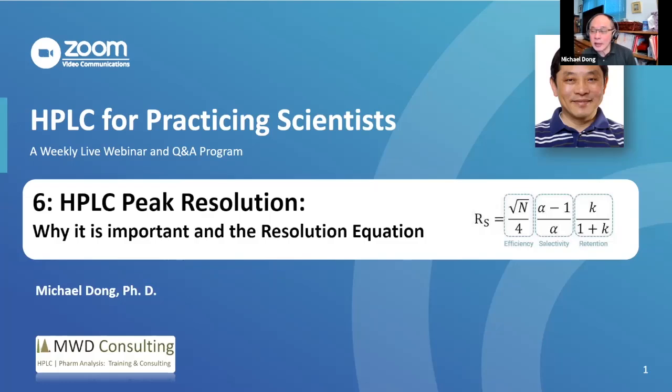And we're going to start today, which is webinar number 6. Okay, so you can see my screen, right? So webinar number 6 is HPLC peak resolution. We're going to talk about why it is important and also when it is not important. And then go into something called the resolution equation. We're going to define what it is, which you can see on the right-hand side, the resolution equation.